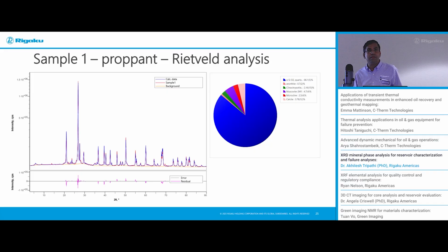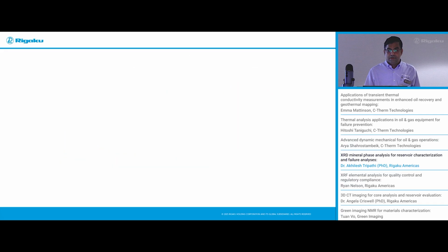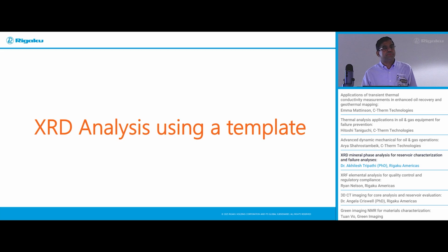Among them, there are swelling and non-swelling clays. And then you can distinguish them. But here is what I bring in. How to do this, because there's a lot of sand coming, and somebody sitting down on all these sand analyzing what is the percentage of sand or the quartz in it would be a huge amount of work. And again, it also requires some experience.